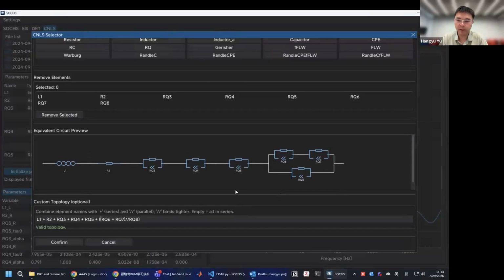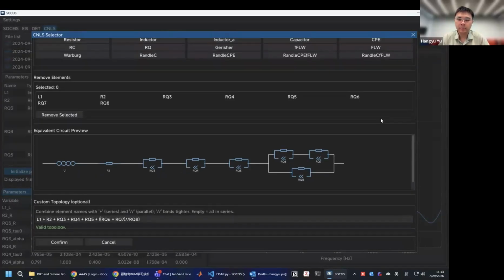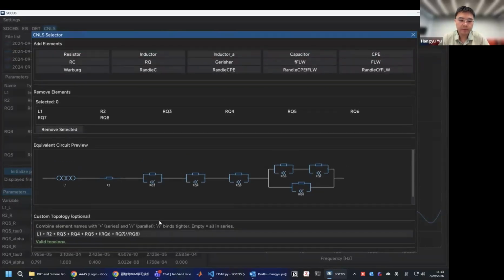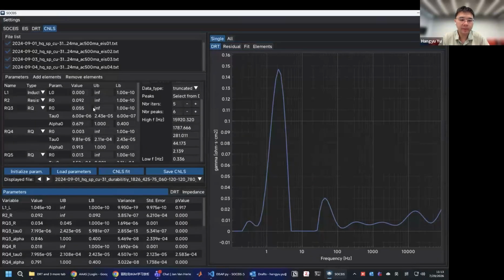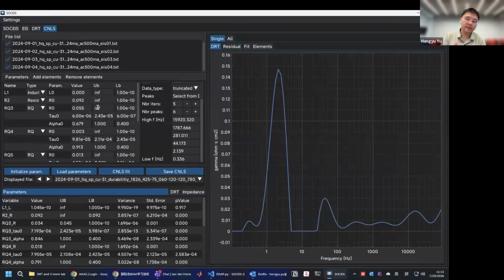So that's one functionality you may use in the future, but if you want to use it, you have to determine all the initial guesses on your own. It's already a non-standardized equivalent circuit model, so you will need to spend some time to become familiar with the option. Maybe restart the software a lot of times to avoid certain bugs. But yes, it is possible.